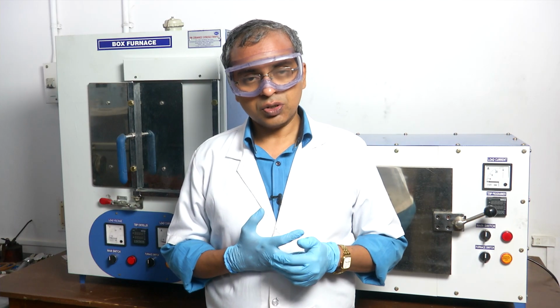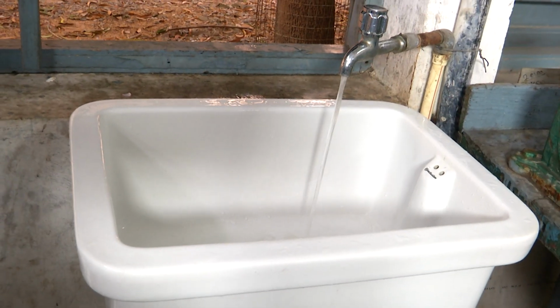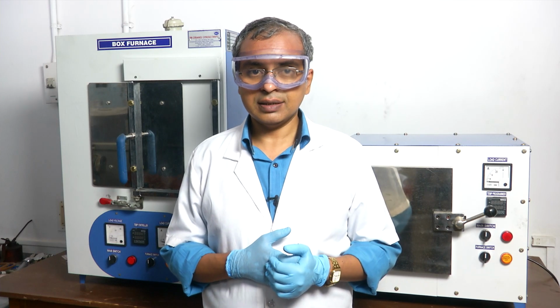So, then the third thing that is commonly present in labs is water. We always have some kind of a sink or a wash basin where you are going to clean maybe glass utensils, maybe your hands, a few different things that you might do there.